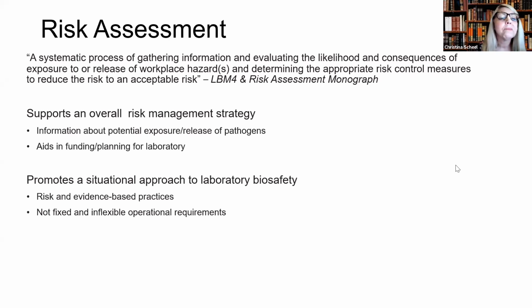Okay, there we go. So one important thing is that risk assessment supports an overall risk management strategy, which can be at the institutional level or even at the national level. Information about potential exposures or releases of biological agents should and do figure into the larger enterprise risk management strategies of organizations. And this can aid in planning and funding for purchase of supplies to control these risks and prevent laboratory incidents that could cause harm.